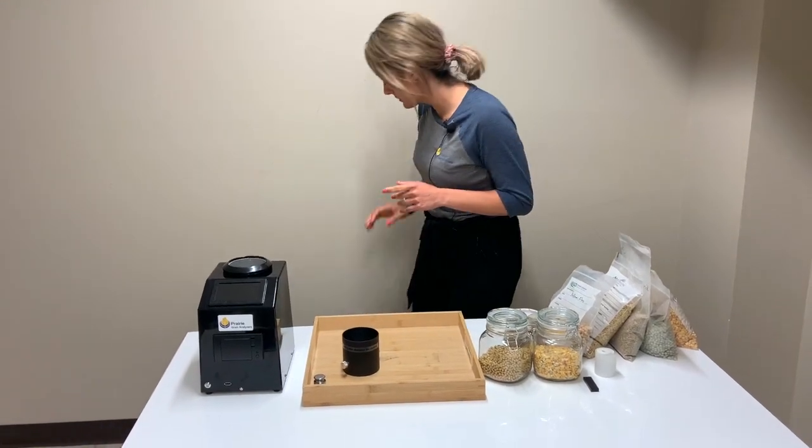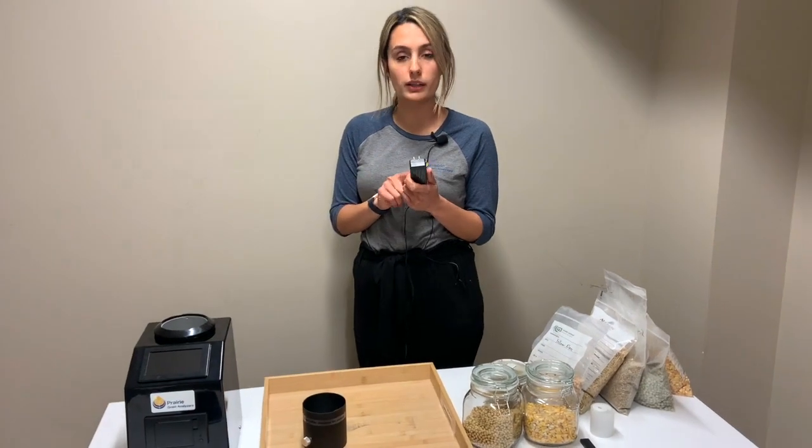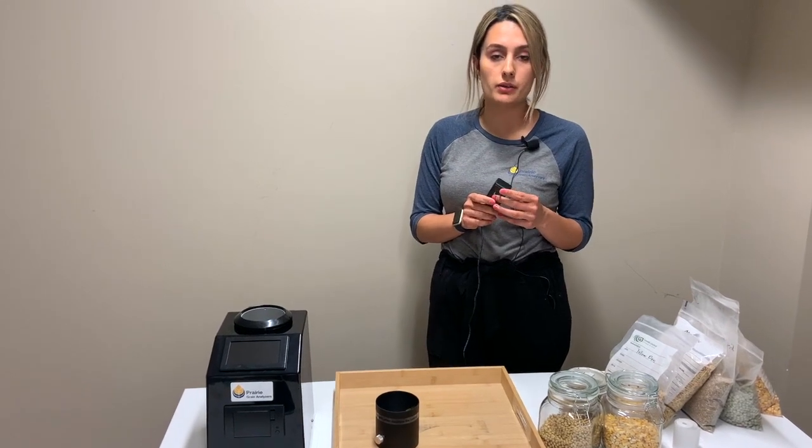The tester comes with a charger like this and it will plug into a wall outlet. We recommend that you avoid charging the tester in a combine, a truck, or any other motor vehicle because it could damage the tester and the charger.